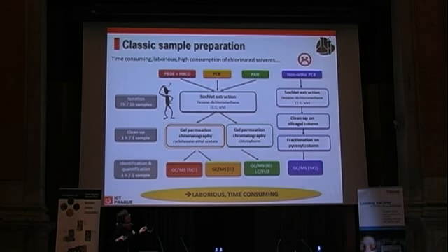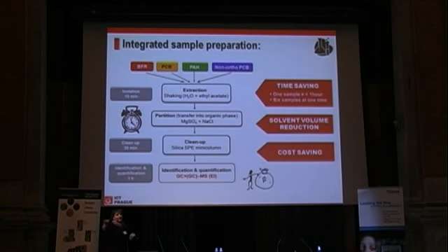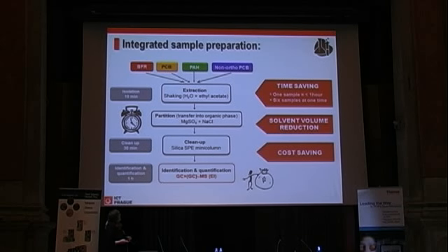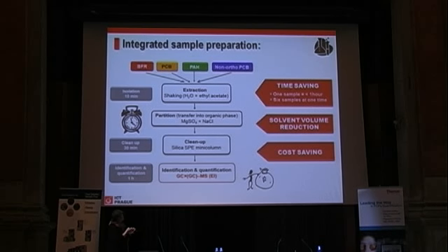And now I am skipping our period of development, and actually the essence of our successful project was the flow chart which you can see here. And the flow chart is very different even from that which was introduced by Jeff. Because what we do at the beginning, instead of desiccation of the sample, our matrix was fish tissue or seafood. And at the beginning, instead of desiccation, you add some water to your sample, you add some salts, and you apply something you may know as the QuEChERS procedure. Contrary to the original QuEChERS, we didn't use acetonitrile, but we used ethyl acetate as the solvent. I will show you, we tested both approaches, but this one was better.